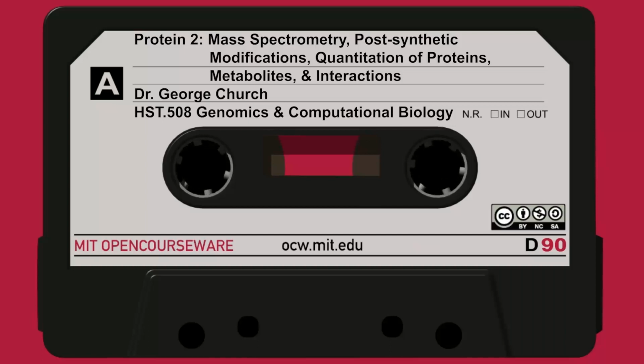And this correlation coefficient serves as a way of prioritizing your scores, and very often the best score will be the database hit for the peptide that you want. Now, if you're expecting post-synthetic modifications, you need to tell the algorithm to add that appropriate mass to the appropriate amino acid. So, for example, if you expect a phosphoserine, you have to put the phosphate mass into the program and associate it with a serine. So the serine can be either a regular serine or a phosphoserine. So that's another complexity there.